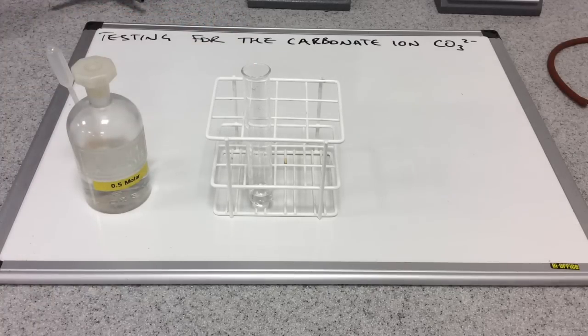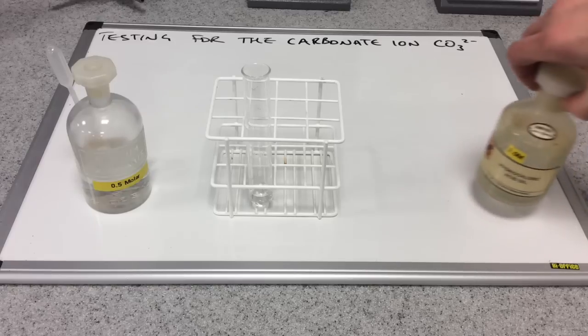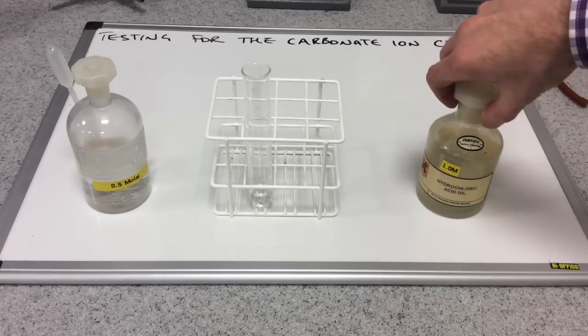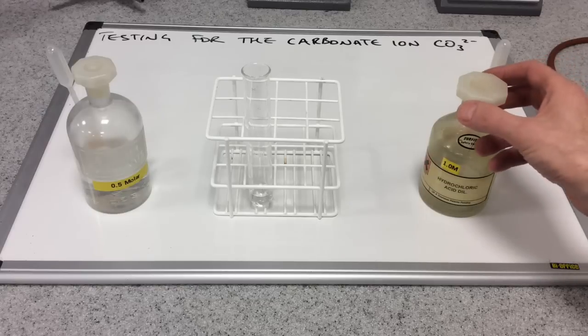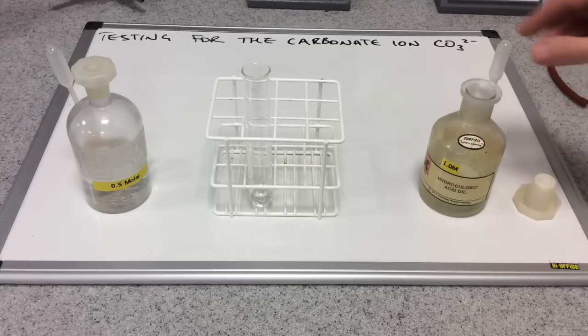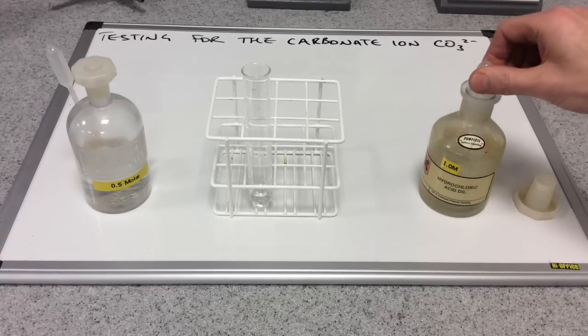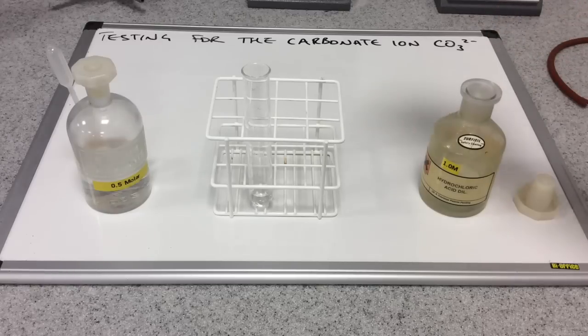And what I'm going to do is I'm going to add to that some acid. And the acid I'm going to use is dilute hydrochloric acid. So we'll just put a pipette full of the acid into the carbonate solution. And we'll see what happens.